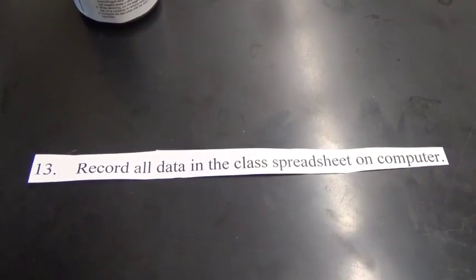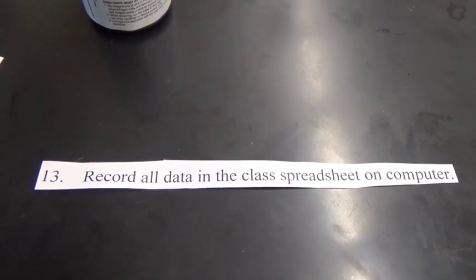Number thirteen. Record all data in the class spreadsheet on the computer.